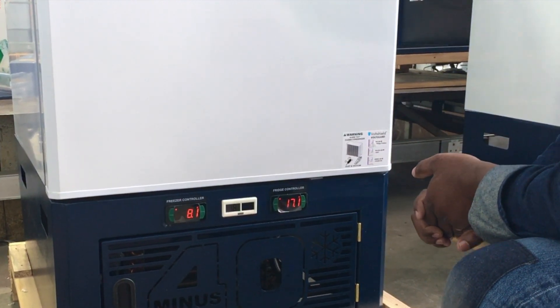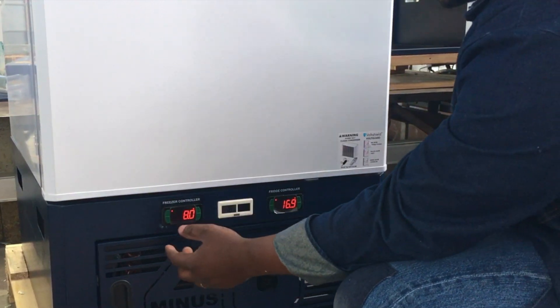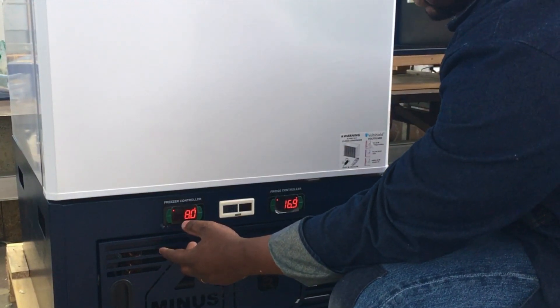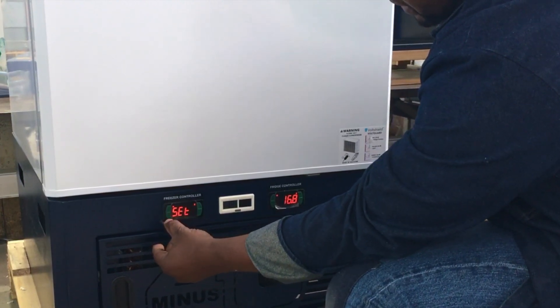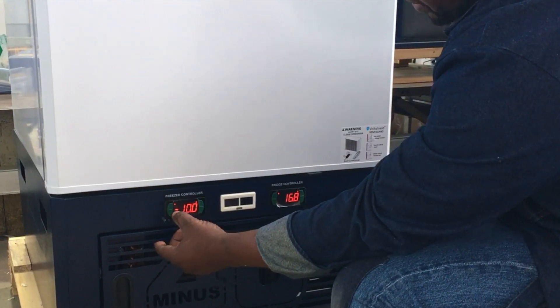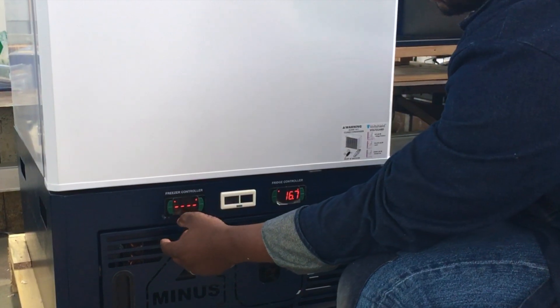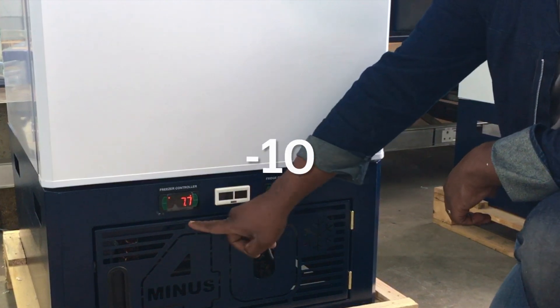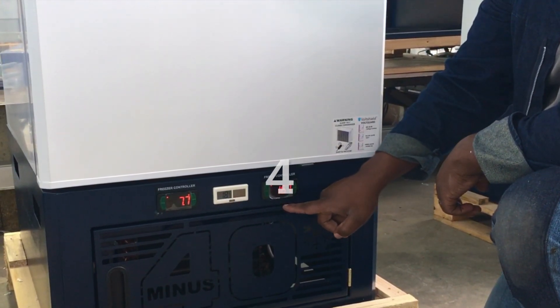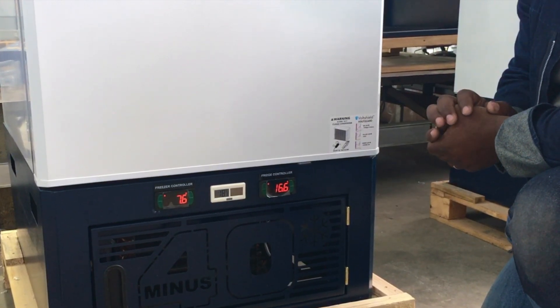The freezer controller cools down faster because there's nothing inside the freezer. To check the set point, press and hold the set button until you see 'SP' appearing, then release. Make sure it shows minus 10. Press set again to return to the freezer temperature display. If the fridge is not at 4 degrees or the freezer is not at minus 10, the settings are not correct and you have to report this to the office.